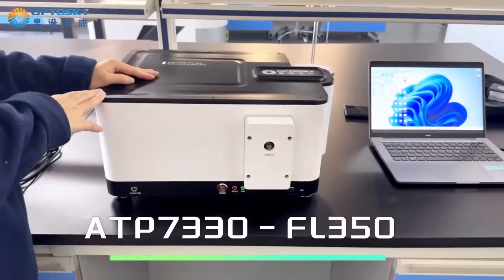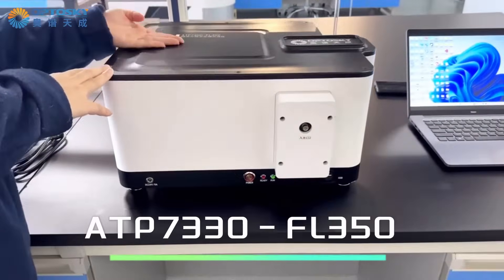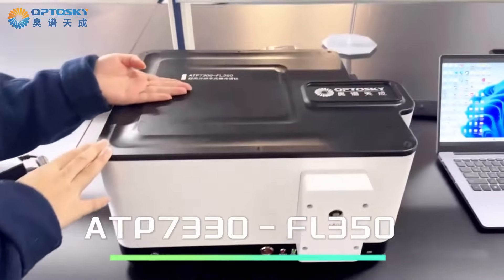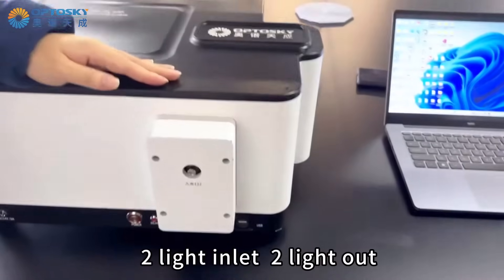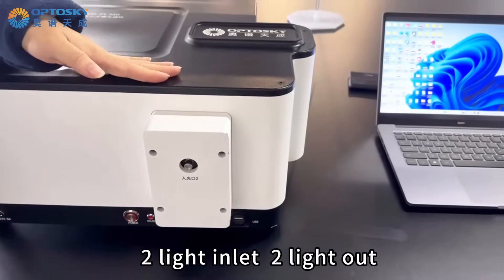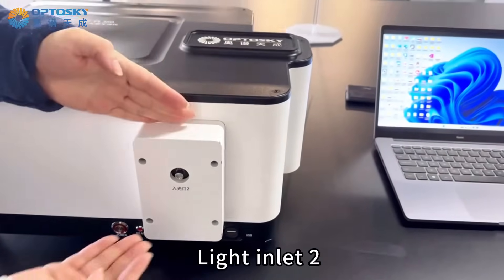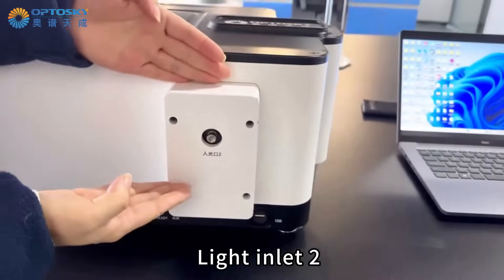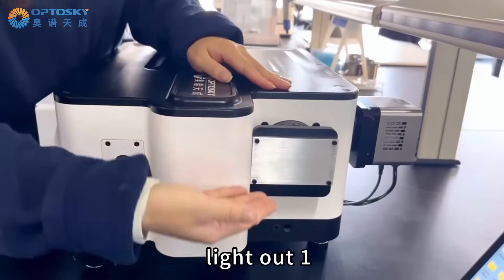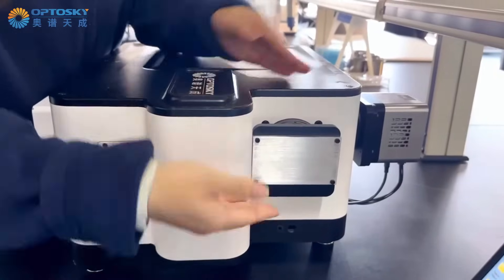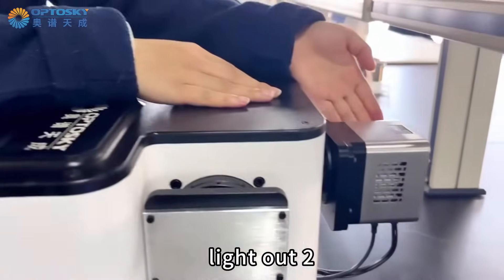ATP7300 and ATP7330-FL350 grating spectrometer. Two light inlets and two light outlets are available. Light inlet 2, light inlet 1, light out 1, and light out 2.